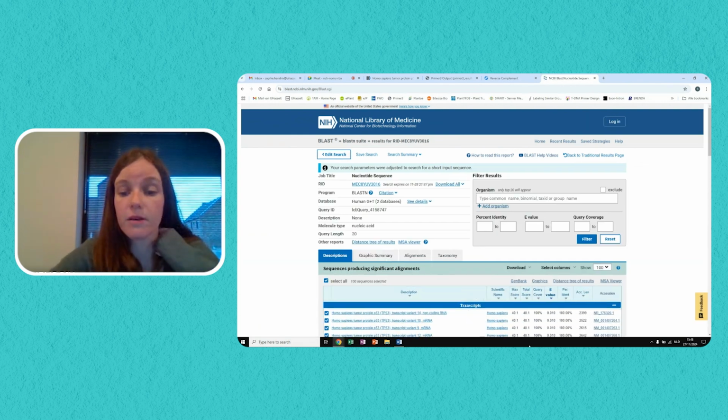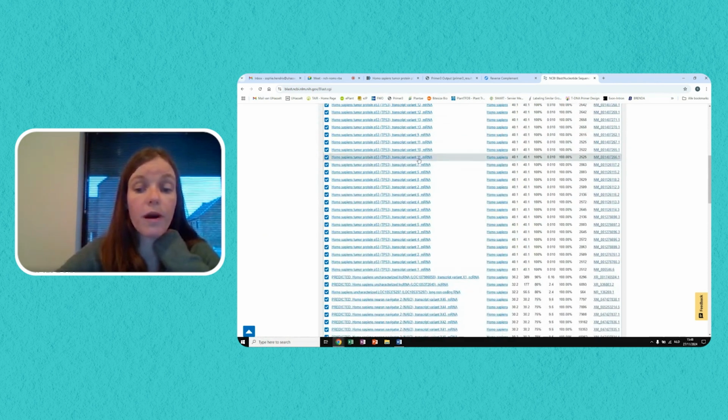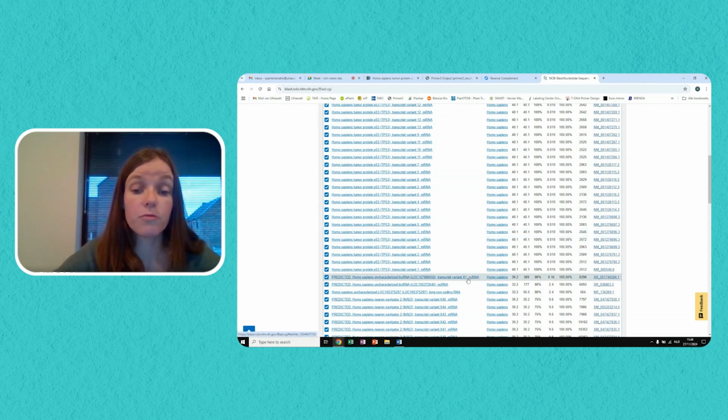Voila. Then we will again see that the reverse primer will bind to the different transcript variants of p53. But now we will see that the next hit, which is a different gene, also has a relatively low e-value. So in this case, the e-value is 0.16, whereas ideally we would want it to be 10 or higher.